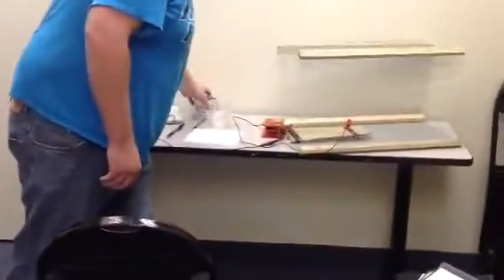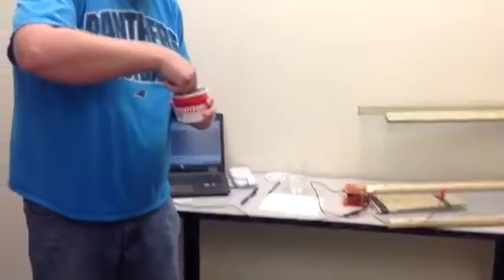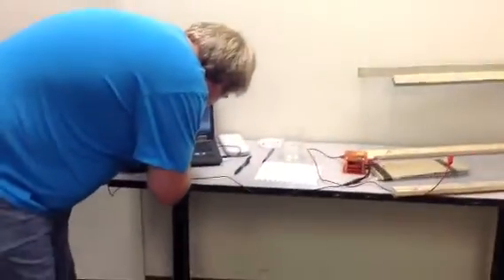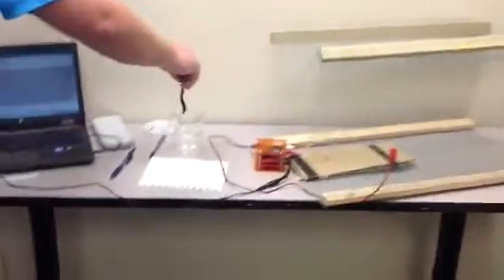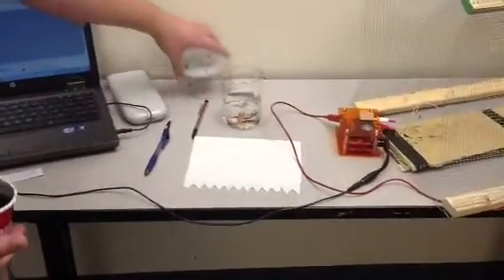I'm going to start by taking one of the worms and putting him in the 10% alcohol solution for 10 minutes. So at 9:22, we will run the first trial.